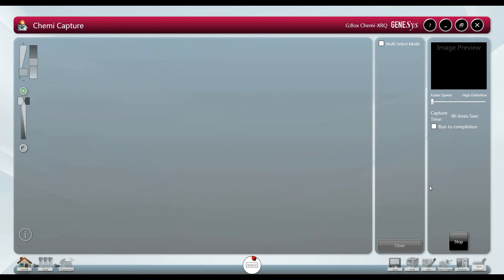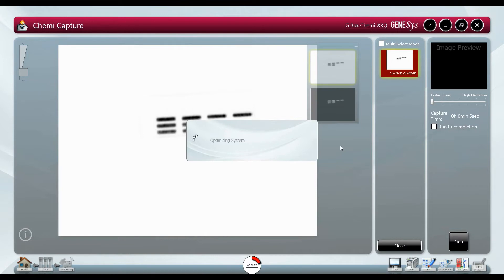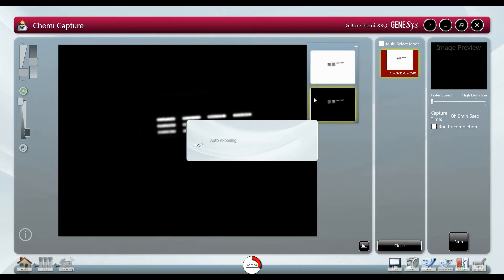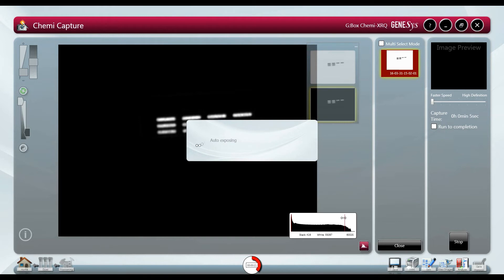As with all automated captured images in Genesis none of the pixels will be saturated by the sample which is ideal for quantification. The protocol can be saved to the home screen to save time when setting up future samples.